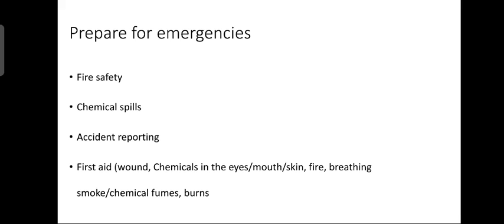Under all circumstances, a laboratory coat, safety glasses and gloves should be used for self-protection. Always send for help first and report the necessary information like the place of incident, the chemical involved, injury to people, etc. If the spill presents an immediate danger, leave the spill site and warn others. Control entry to the spill site, remove contaminated clothing.